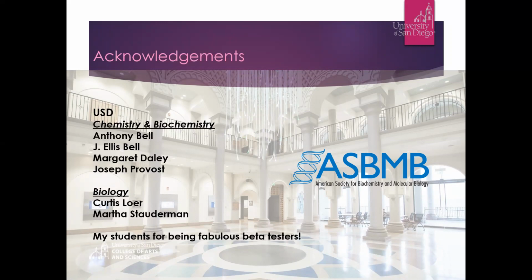Jessica, thank you. Couple questions that came up. One is about, do you use electronic notebooks in your labs? I do. I use Lab Archives. And you like that? Yeah, and we use them from General Chemistry, which just started, OChem uses them, and now Biochemistry and Moltec. We've been doing it for about 3 years.